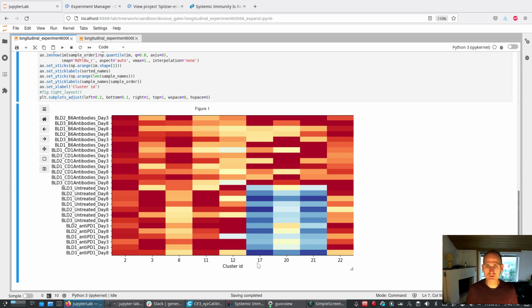So that's the first thing I do, and then I kind of enhance the signal so that I emphasize the difference between, in one column, in one cluster, the different files, so that I get a color map that shows me what is the signal here.